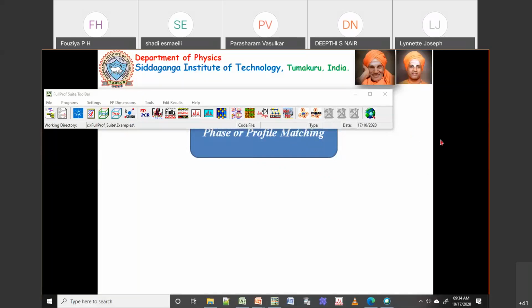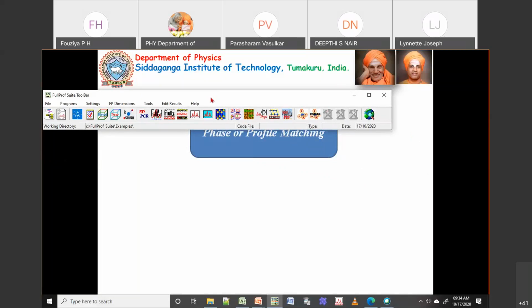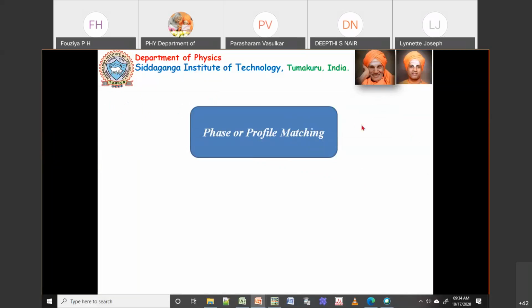You can also use your own sample data. For the beginning, we will just try with known data so that you don't face any problems. Later on, you can try your own samples. Tomorrow I will send you two quizzes and assignments. You can practice these assignments and then send them back to me. You can upload them in the Google form.